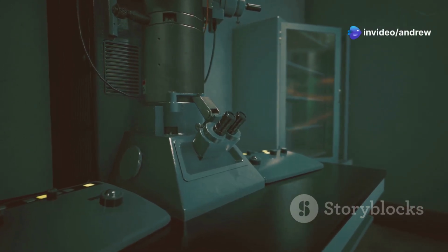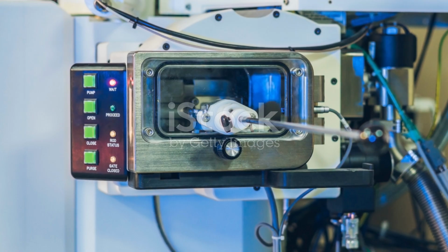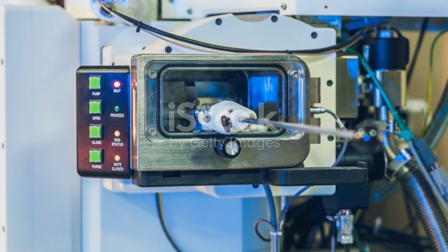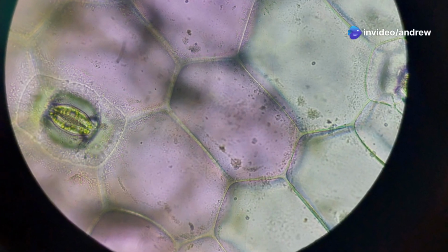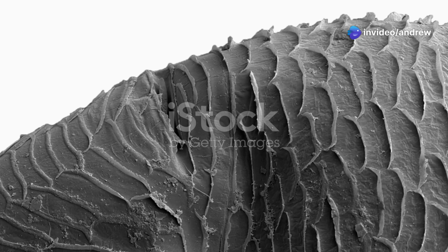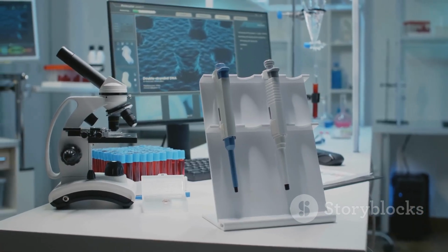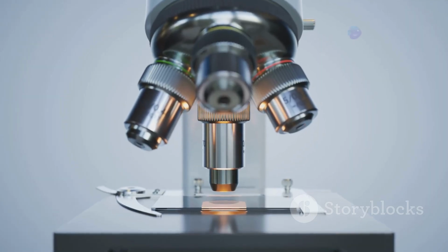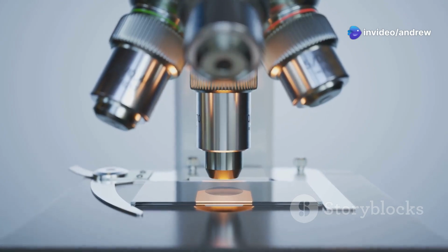The invention of the electron microscope marked a pivotal moment in the history of science. It provided humanity with a powerful tool to explore the world beyond the limits of human vision. From unraveling the complexities of biological systems to designing novel materials at the atomic scale, electron microscopy has revolutionized countless fields.